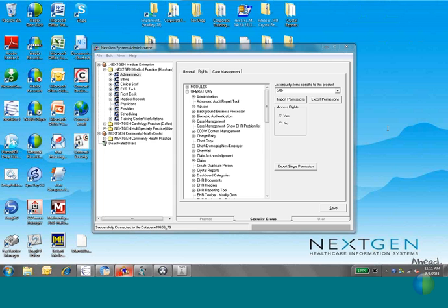But I do have to warn you, it's not just a little bit of development. It's, in some cases, taken people up to 80 hours of customization. And usually I say between 40 and 80 hours. So it's something to really consider if you need it or not, because you can use the orders module independently of the templates. And that again is if you're below the 7.9 KBM. If you currently have 7.9, then your templates are not going to need the customization out of the box that everyone else will.